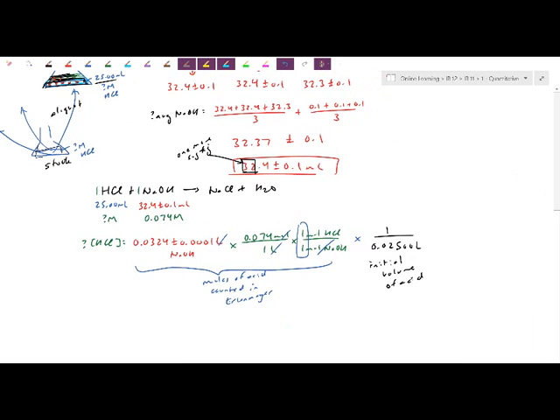Basically, it's going to be 0.0324 times 0.074, that was the concentration, divided by 0.025, and that gives me the concentration. We can still do a sort of mental check here, 0.0959. From previous, I only had the dilution to 2 sig figs. Unfortunately, I'm still limited to just say 0.096. But if I had, for example, the titrant volume for NaOH bigger than 10, I would have this to 3 sig figs. With 3 sig figs, I can actually keep that 959 in that case.